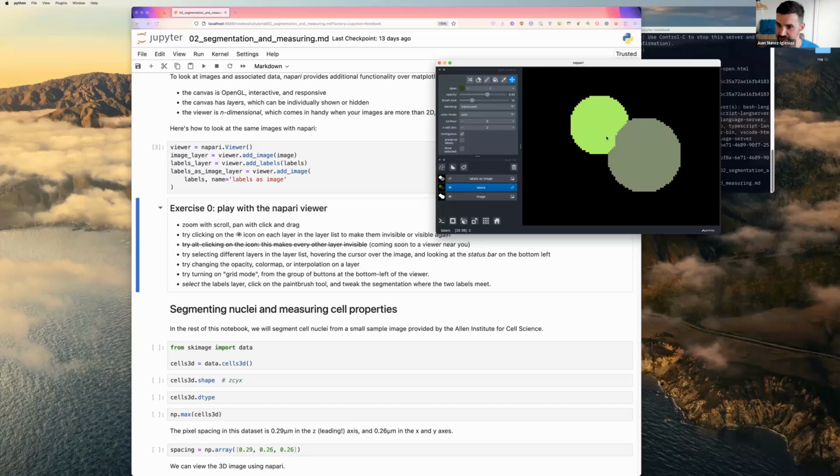The last thing that I wanted to show is that one of the things that napari is good for is editing and tweaking things. So it's usually rare that your algorithms will give you exactly the result you want. So in napari, you can take a paintbrush and then sort of fiddle with the output. So let's select a different label. You can do it manually here by increasing the value, or you can do it by selecting a label. So that picks that label, and then I can paint. Okay, so that's more or less it.